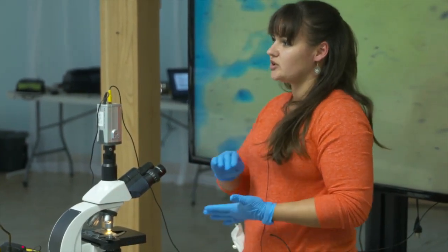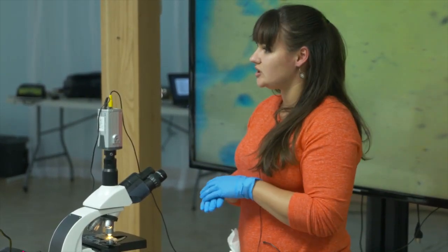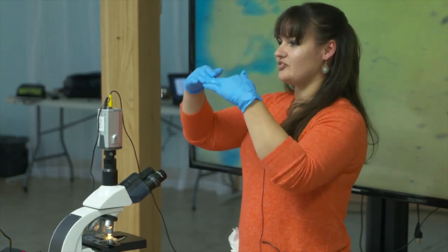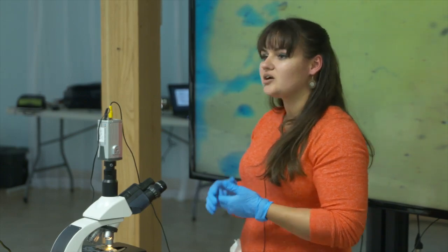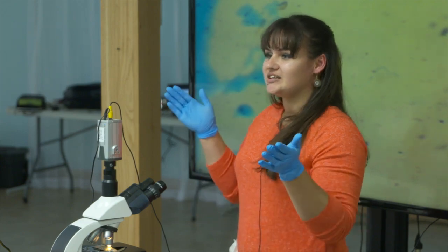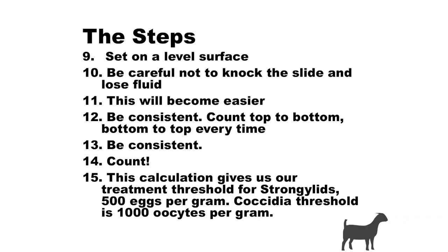The second biggest thing is make sure when they're waiting, you set them on a level surface. If you set them on paper towels and they're tilted, the eggs aren't going to float straight up to the chambers — they're going to float up to the edge and you're not going to count those. We had to redo a bunch of samples because the eggs were where they were not supposed to be counted, on the edge of the grid, due to the slide being off balance.